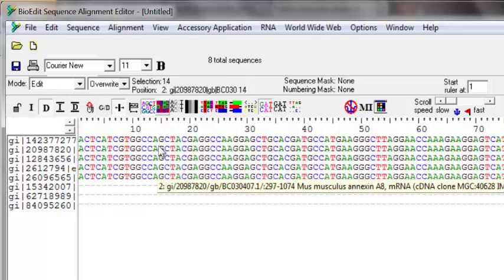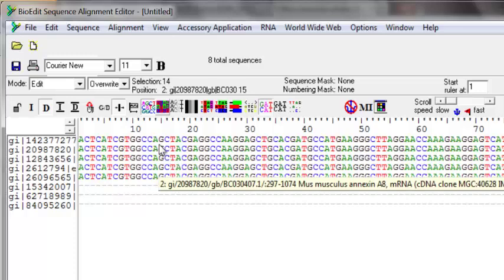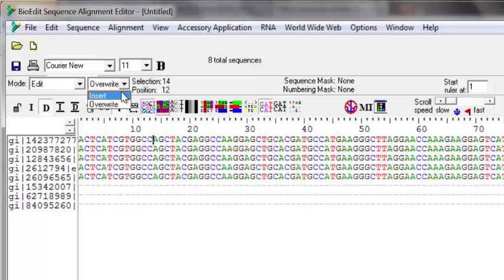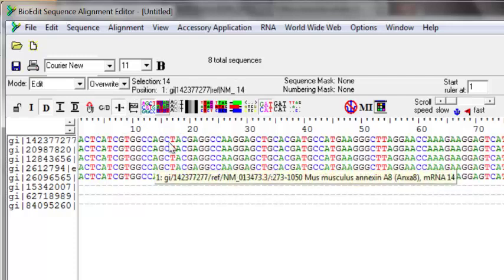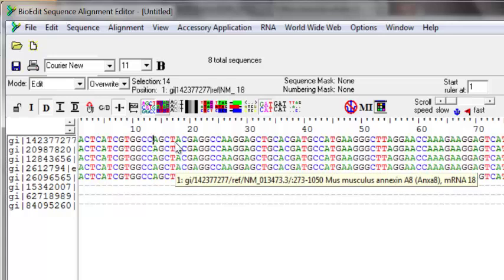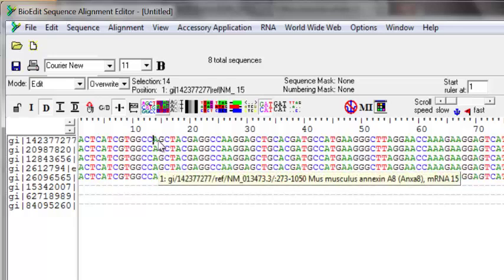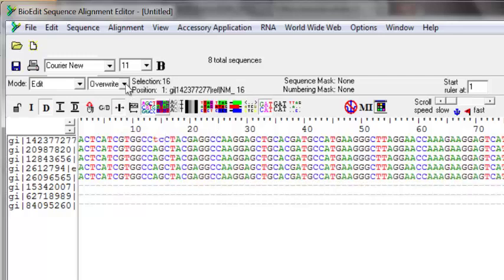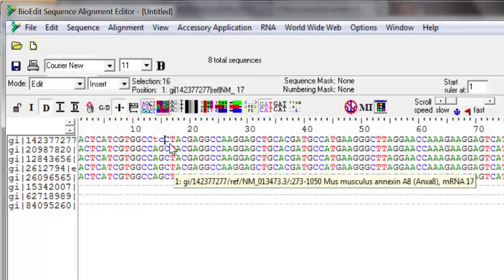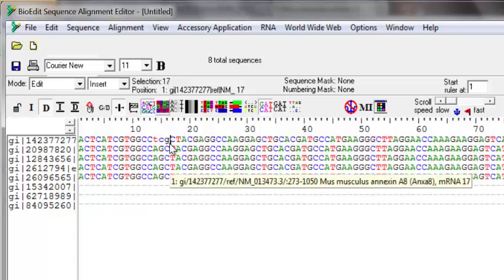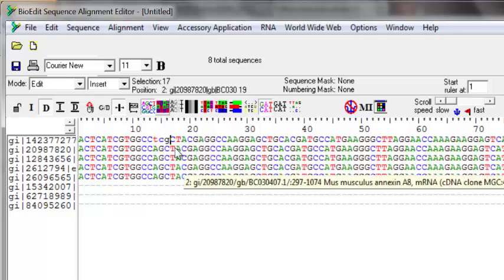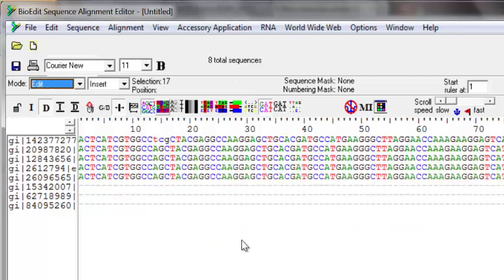In the same edit mode you can also change bases in the sequence in the alignment. You have two options: overwrite mode and insert mode. In overwrite mode, pressing any base key overrides the base next to the cursor — for example, pressing T replaces A, pressing C replaces the next base. In insert mode, pressing G will insert G between two bases and shift the sequence one base, instead of overwriting.